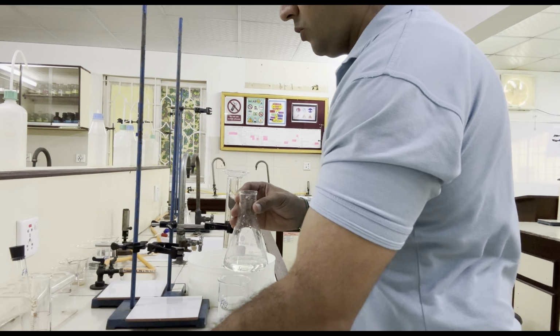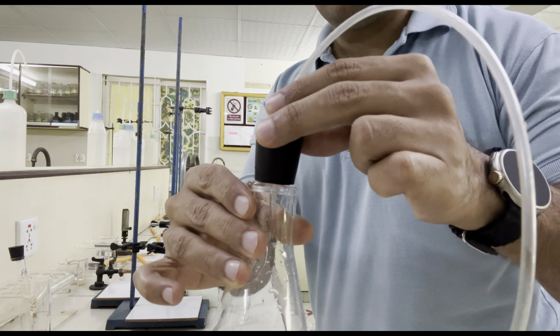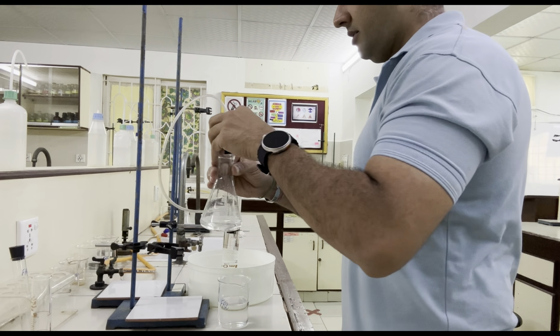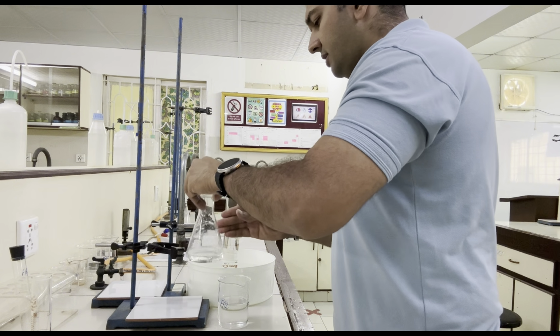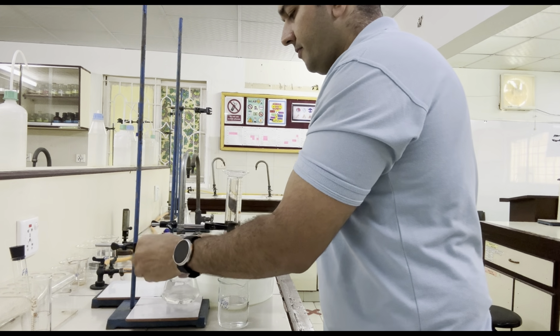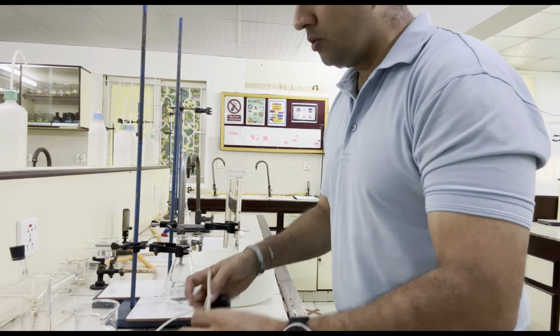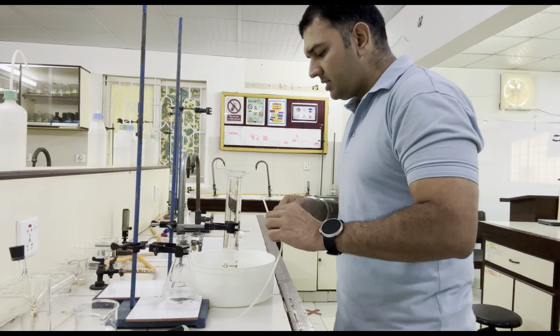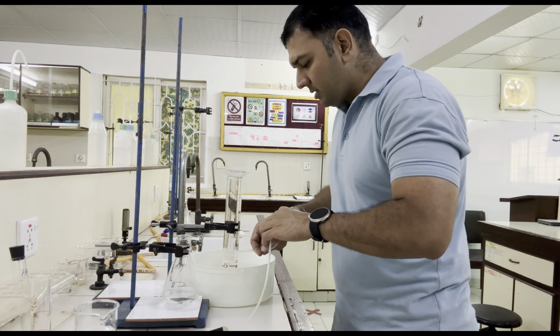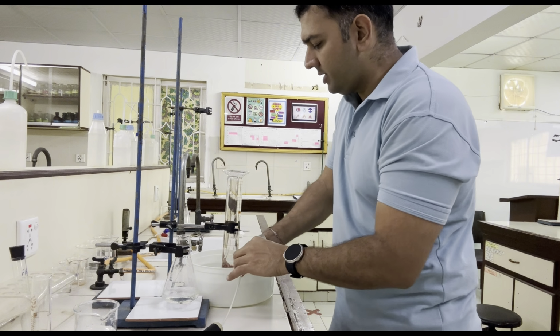Now I will check whether the rubber bung fits tightly on this flask or not. So this is the rubber bung. It fits tightly. Yes, it is tight. Now let's hold this conical flask in this clamp and pass this delivery tube through this measuring cylinder so that the gas collected will go there. So I will pass this tube from the bottom into this bigger measuring cylinder.